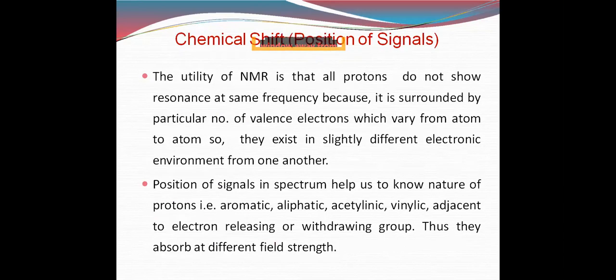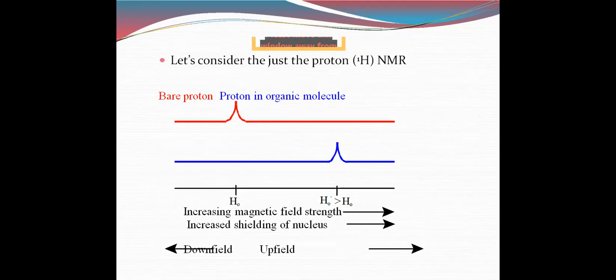Look here. We are looking at these types of hydrogens and the positions of signals, which are written over here. I am explaining with an example how the downfield and upfield shifts take place. I think you understood that upfield means shielded, or shielding.